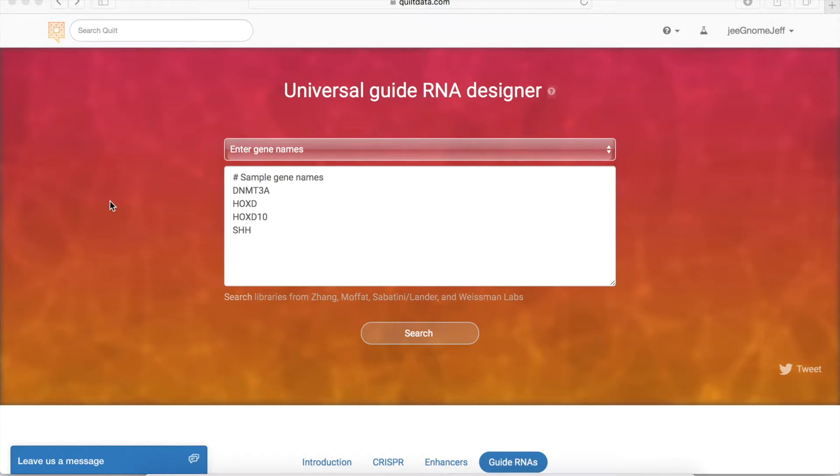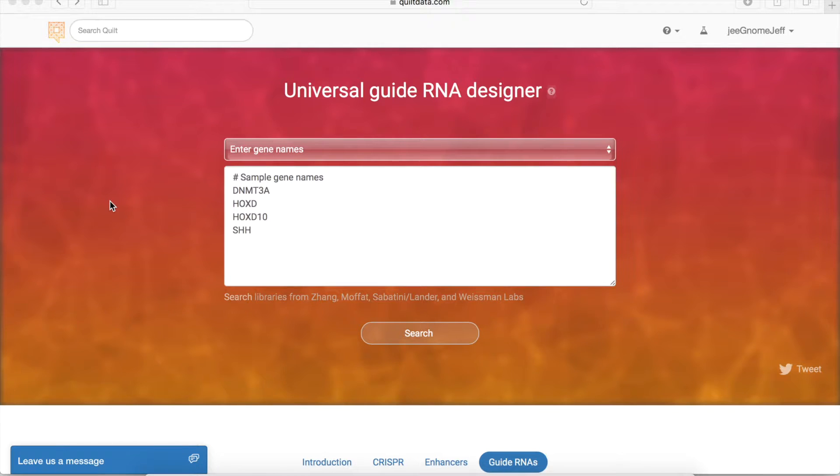We search the universe of publicly available libraries for CRISPR cutting, CRISPR interference, and CRISPR activation.